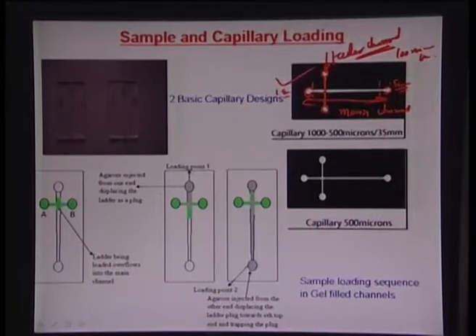So you can feed the DNA here and electrokinetically inject it into the gel in this region, and then you apply a positive and a negative, and the DNA would start flowing in this direction. Simultaneously, if you change the voltage, the DNA would start moving in the opposite direction, and you can have these bands of fractionation developed within these particular areas as the DNA moves.